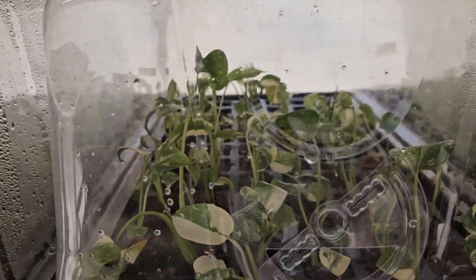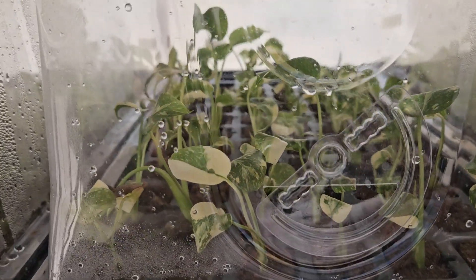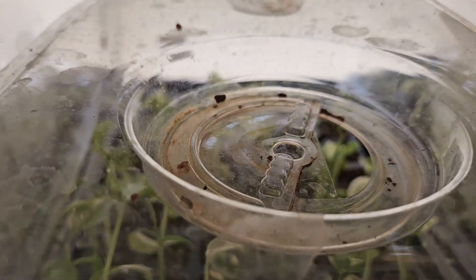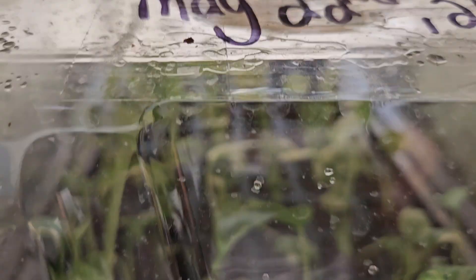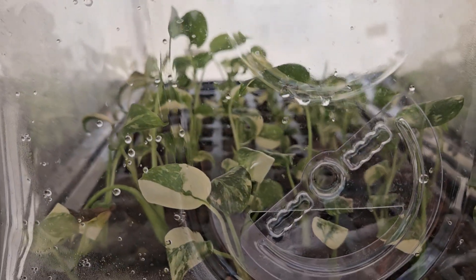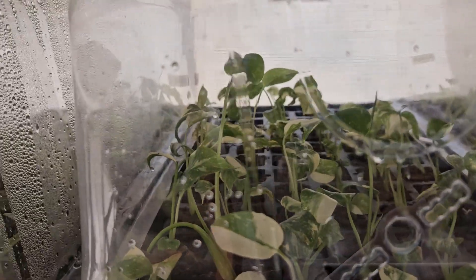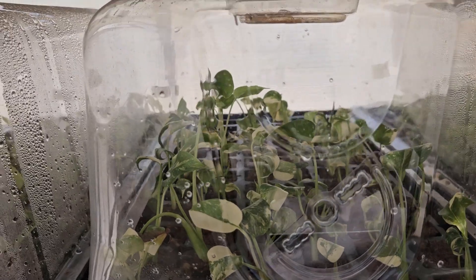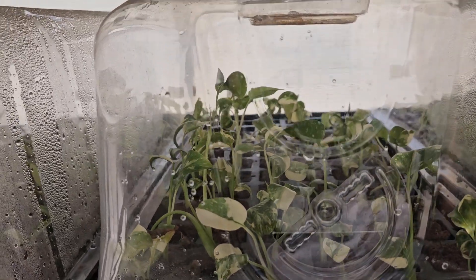Air movement for your tissue culture is actually going to strengthen the stem. Up top here you can also see that we have that lid cracked, but they are still under domes. So for those of you that are doing it at home, this is the perfect time to grab a stack of those humidity domes and poke some holes in them.